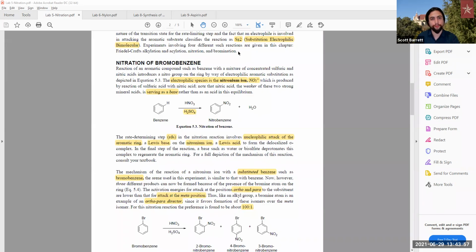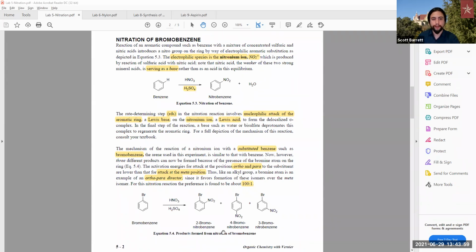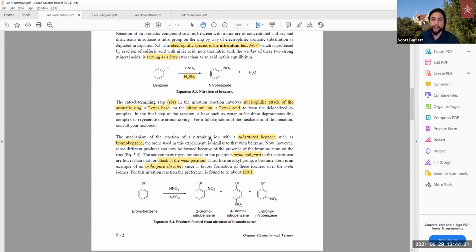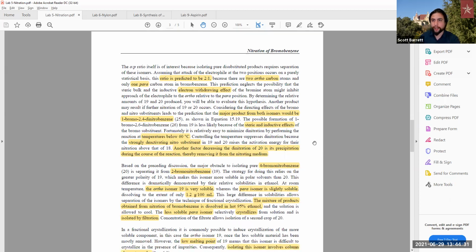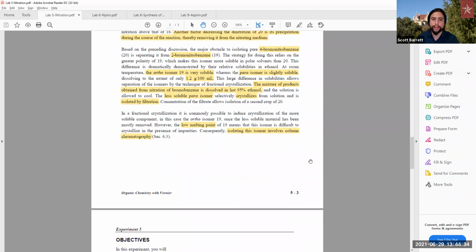So in the case of the nitration of bromobenzene, one big thing to remember is that you can get any form of it, in the sense that you can get your ortho, your para, or your meta. And you should know which one is more favorable within the lesson here. The main thing that I wanted to show from this reaction is the scheme on not only how to nitrate it, but how to get your nitronium prior to that. So going forward, make sure to review down here the reasoning of why we can create our other substituted nitrobromobenzenes and how we would actually isolate it.